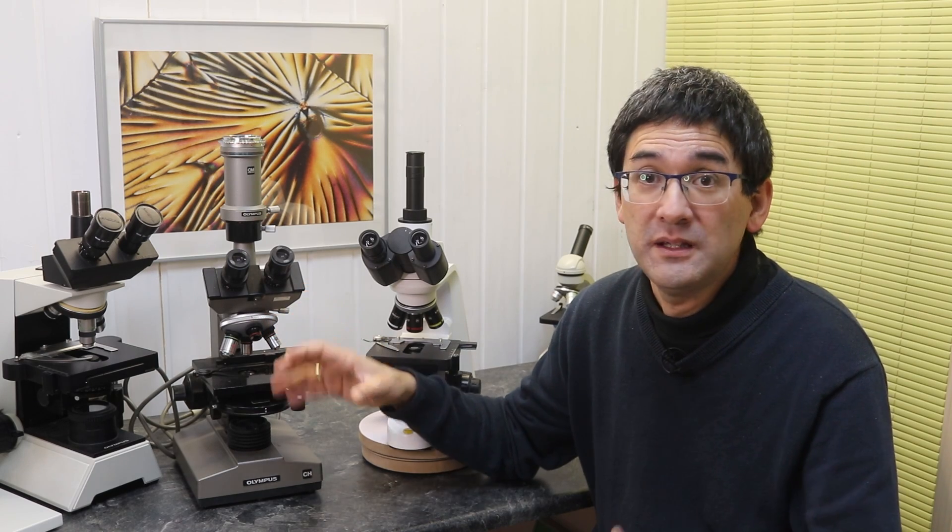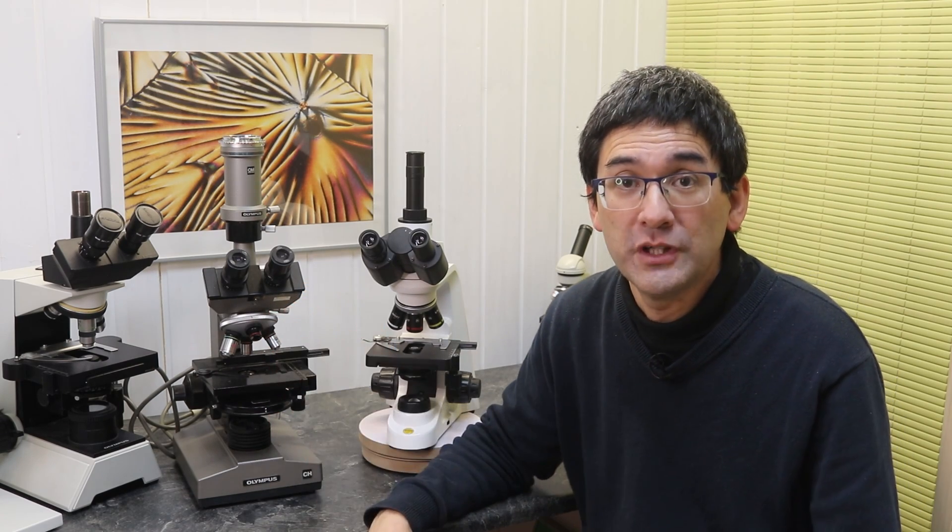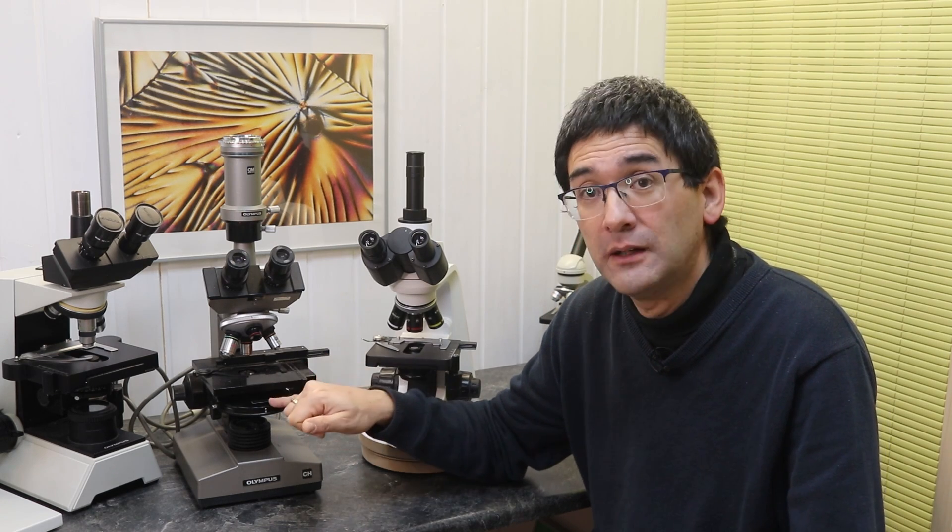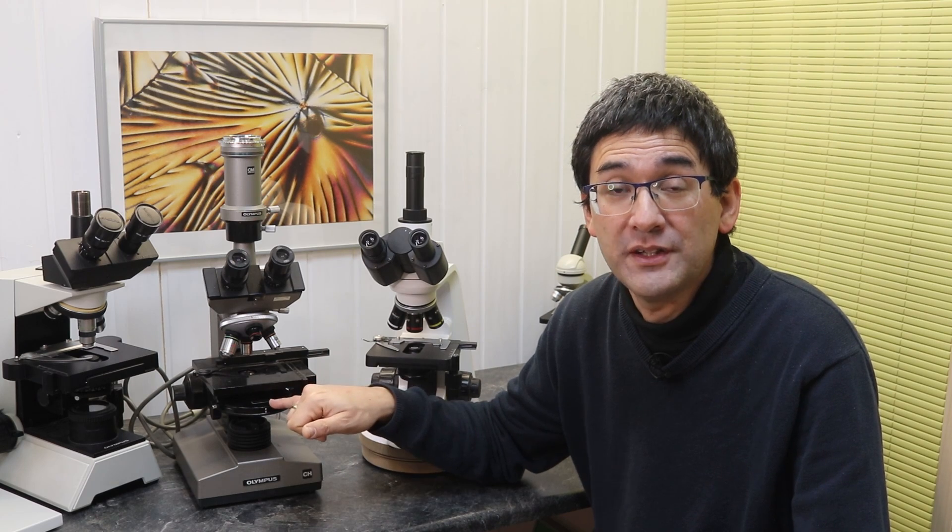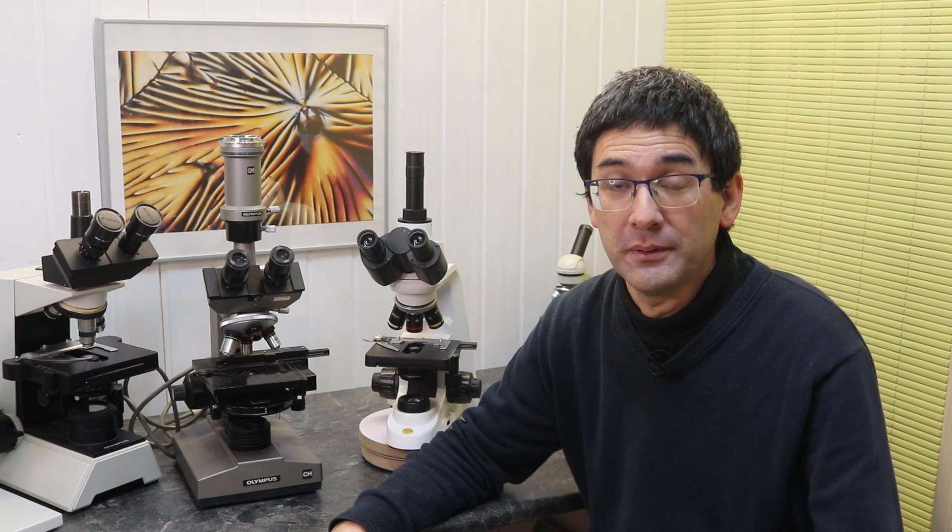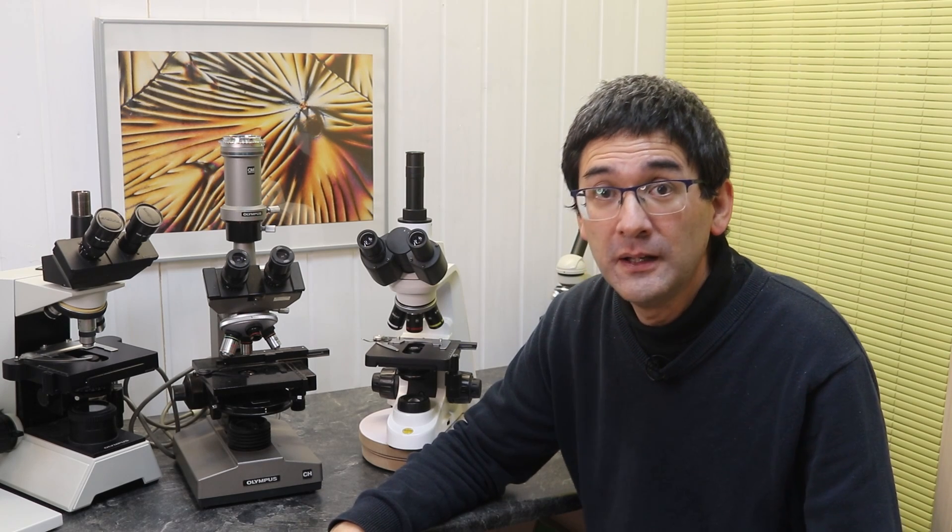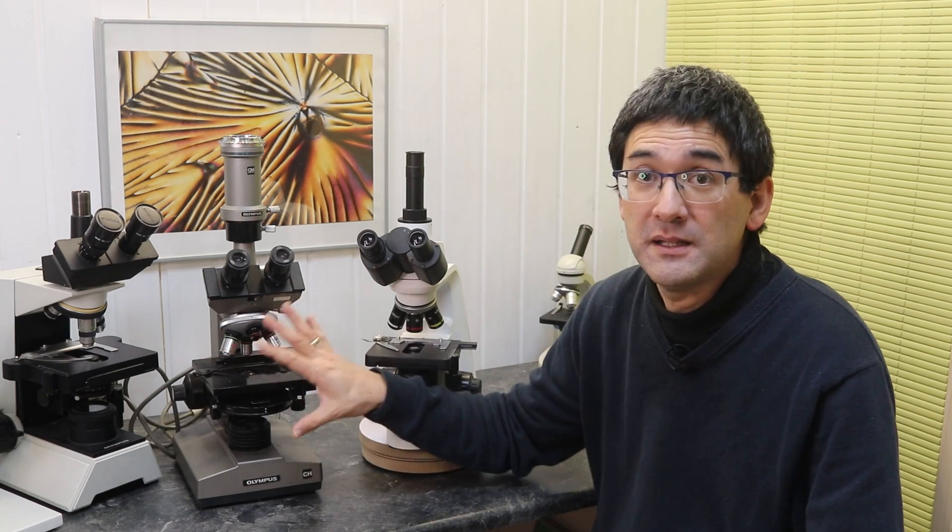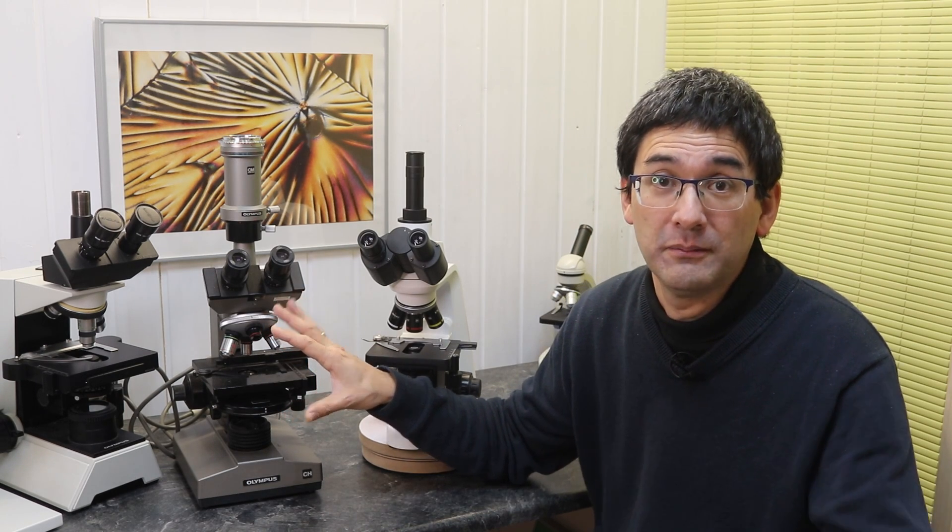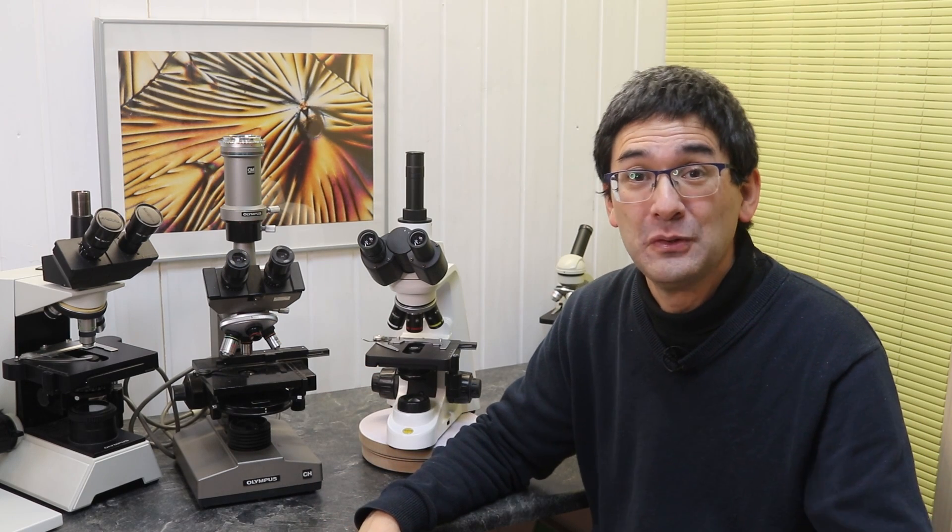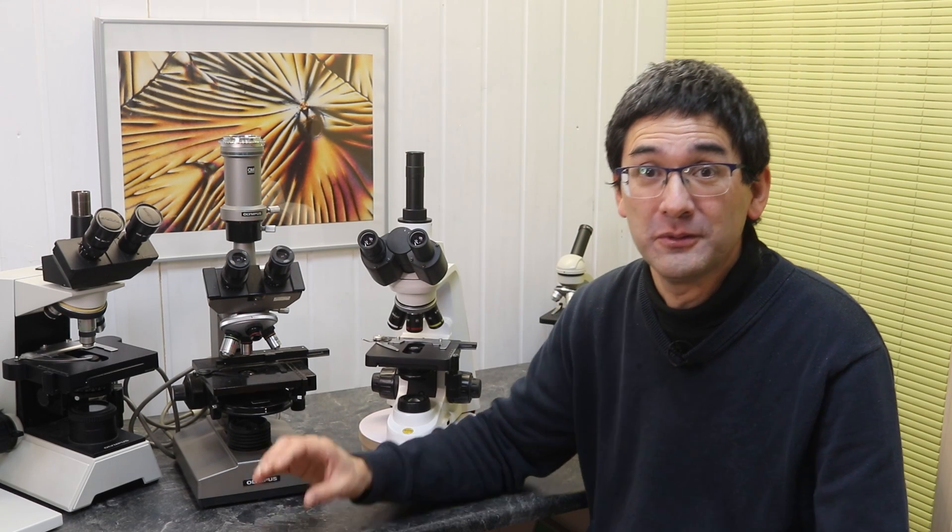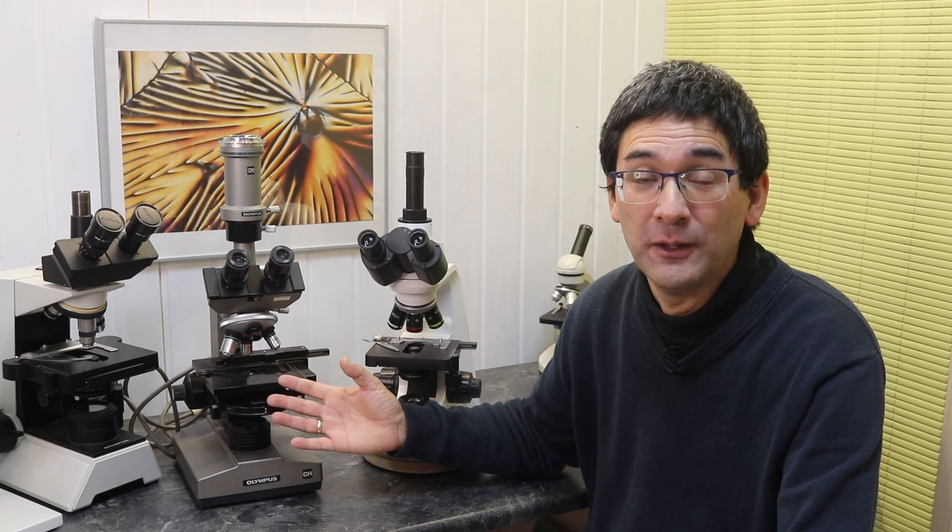With the traditional model there is sometimes a huge second hand market available where you can essentially configure the microscope pretty much any way you want. For example I added phase contrast. I went to eBay, I bought myself a phase contrast condenser and phase contrast optics, all of them used. This is basically the state of the art from 30 or 40 years ago and it worked fine at that time. So why shouldn't it also work right now?